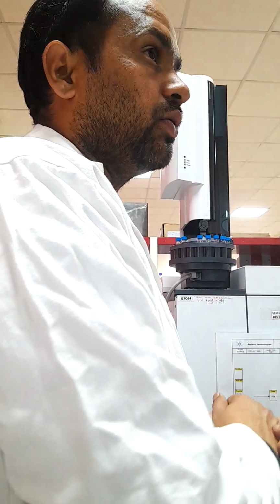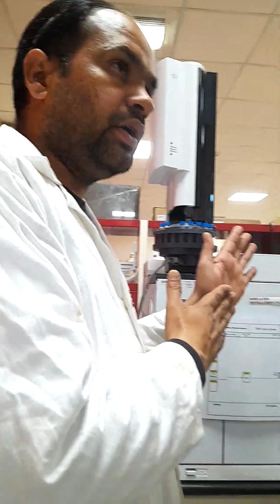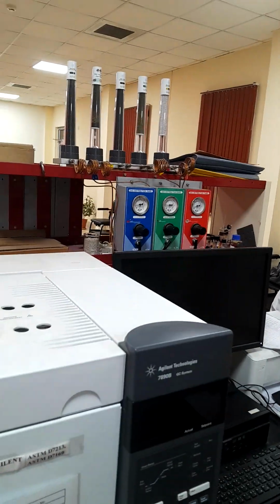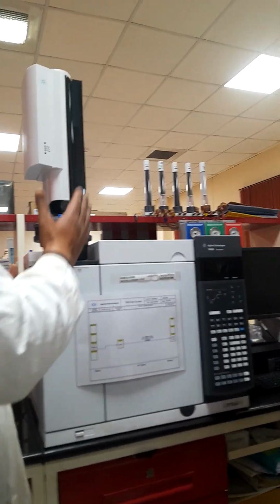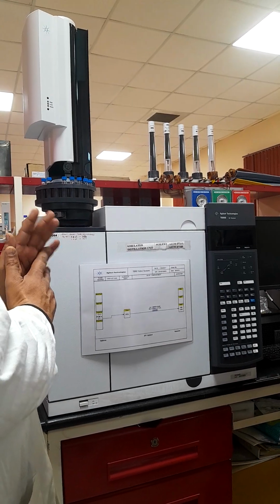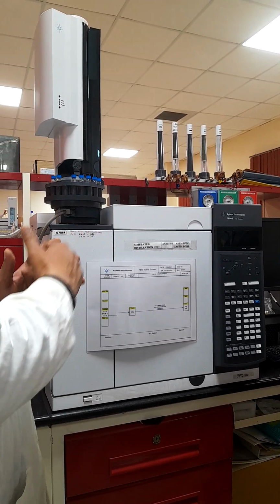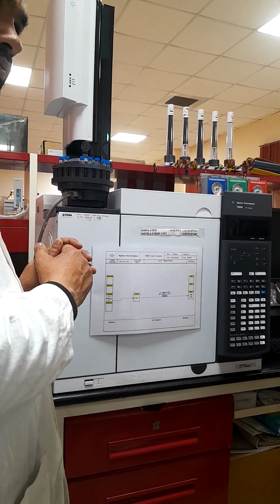This column is made of fused silica, as sir already discussed. In this GC, a separation technique, we require a gaseous phase. We are using a gaseous phase to separate through a stationary solid support. So what is this solid support? Here we have the fused silica column, but what is the support? It is PDMS, polydimethyl siloxane.